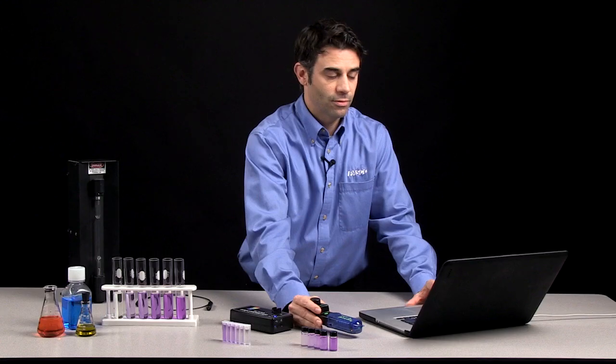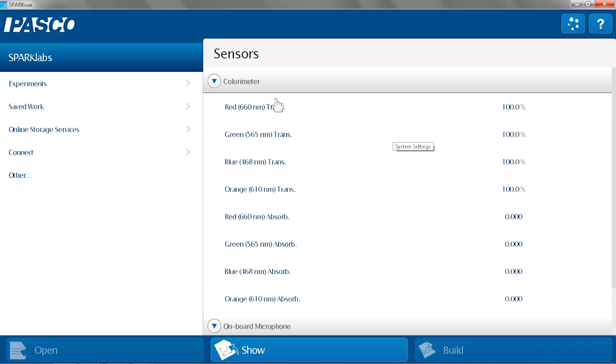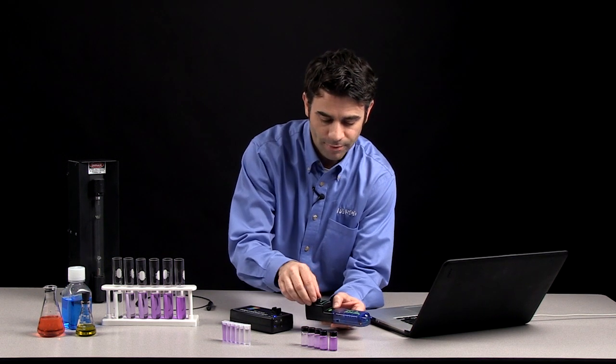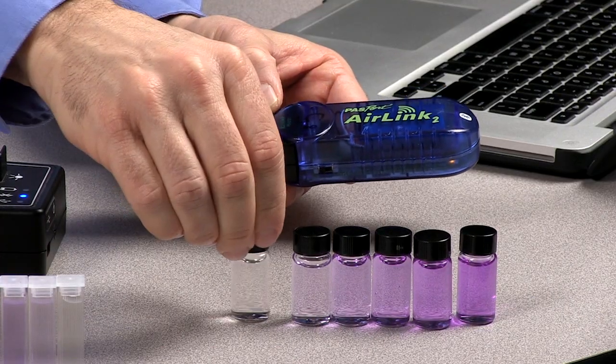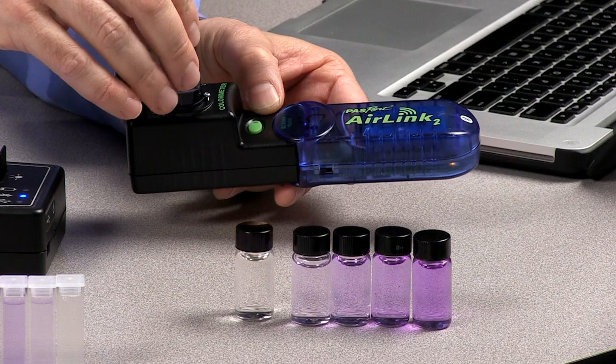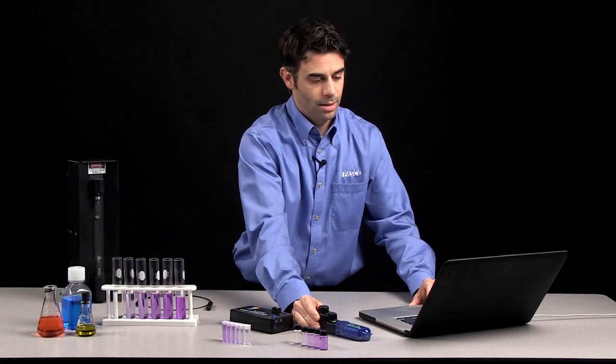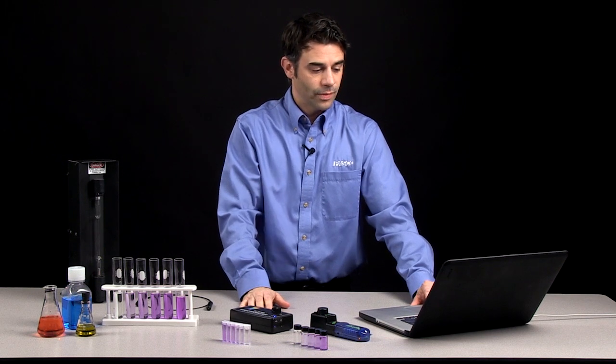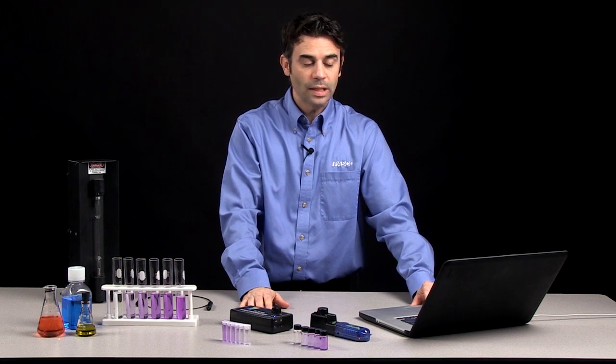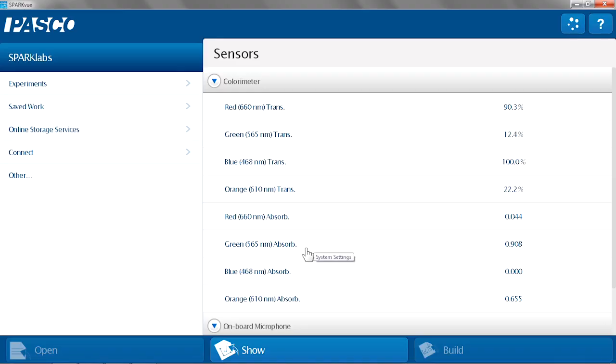The red, green, blue, and orange LEDs. Then in SparkView, right from the home screen, I can put in a sample, in this case some crystal violet, and I can see that the crystal violet absorbs mostly in the green part of the spectrum, with the 565 nanometer absorbance being the highest.